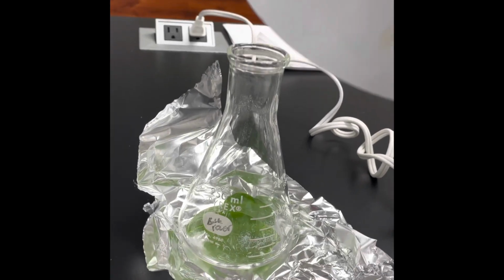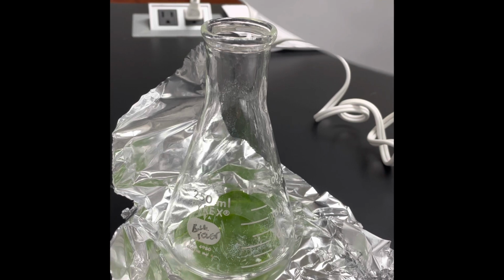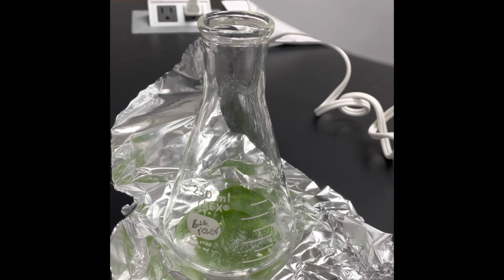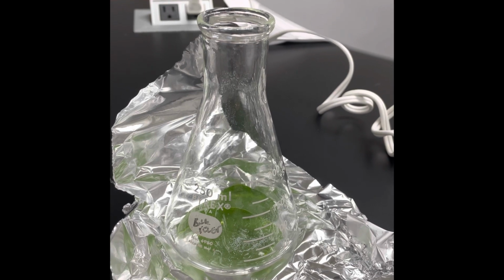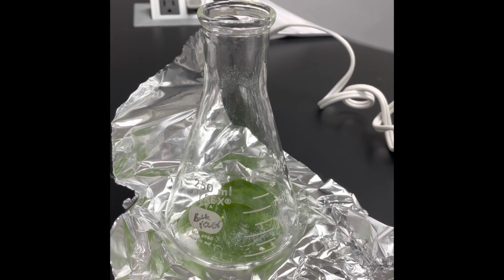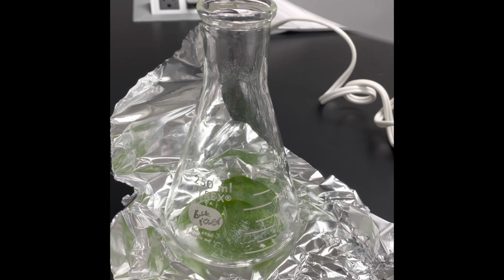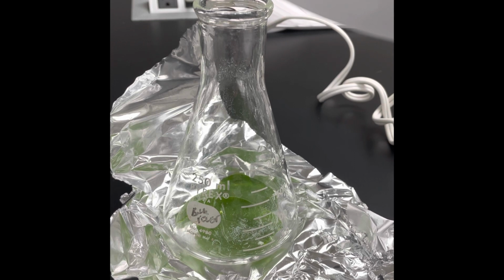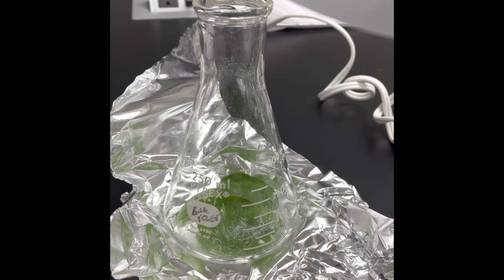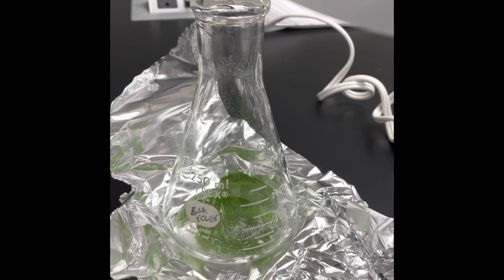What I want to do is add a carbon dioxide detector to this, shine the light, and then measure the CO2 produced or consumed by the processes going on inside after I seal it and turn on the light.